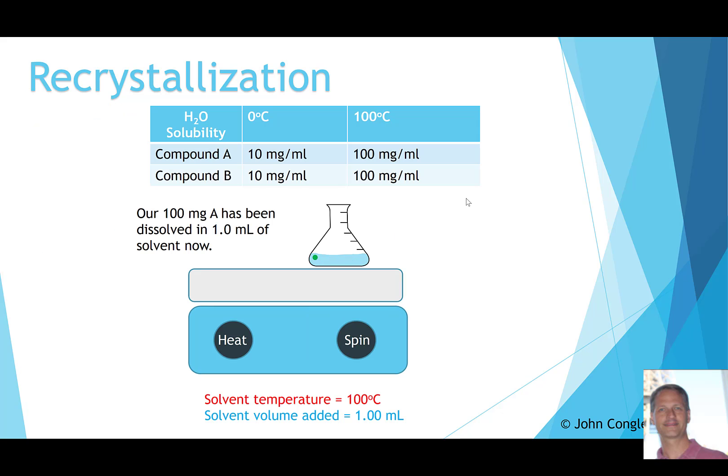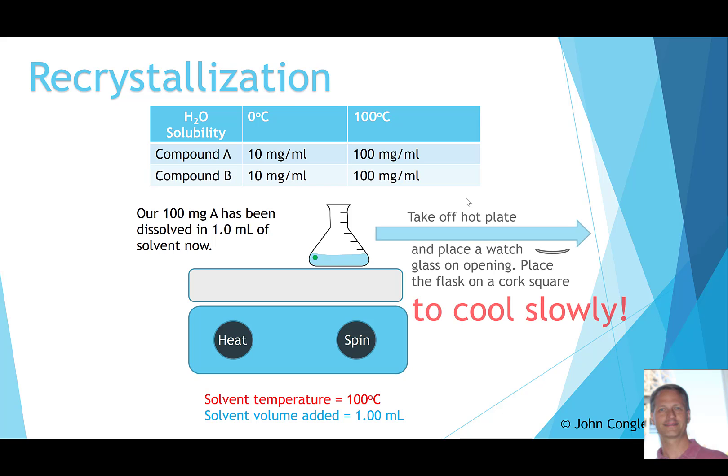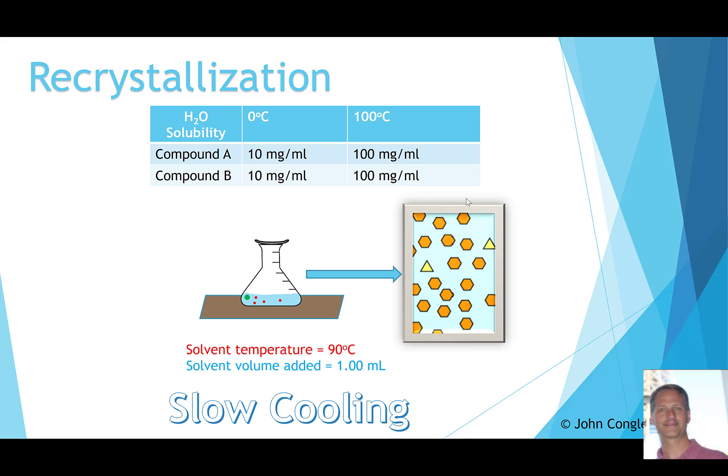Now we have 100 milligrams of compound A dissolved in 1 milliliter of solvent at 100 degrees Celsius. We want to allow this to cool, so we take it off the hot plate, place a watch glass on top to prevent further solvent evaporation, and set it on a cork square on our desk to allow it to cool slowly. This is important.